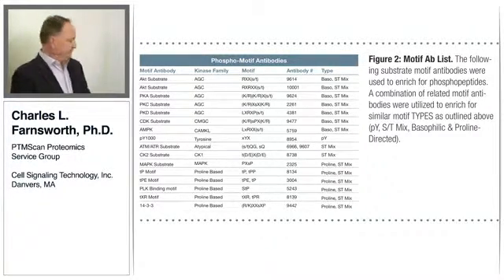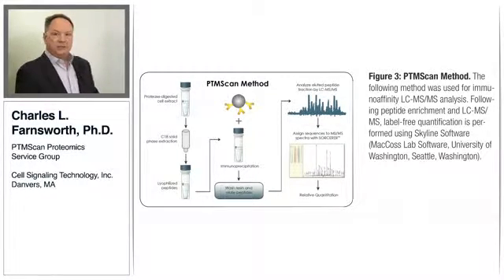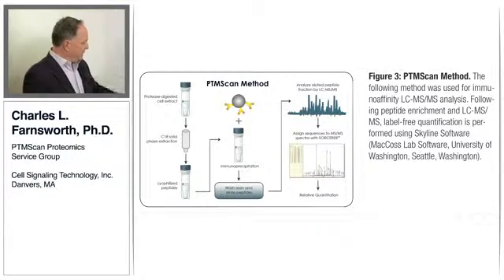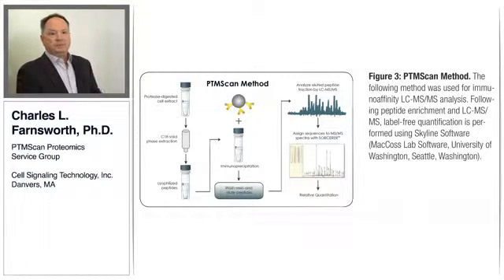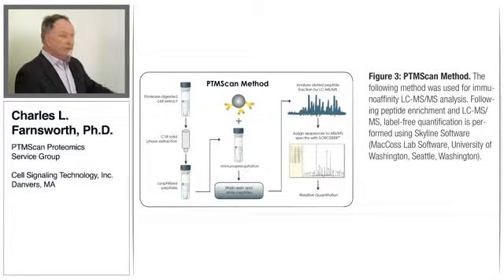We use that alone. The method here for PhosphoScan involves the isolation of the peptides, purification of the peptides, and then central to the method is the isolation of the peptides using antibodies linked to agarose beads. For the IMAC portion of the enrichment method, the same peptides will be used challenged against the metal affinity column here.